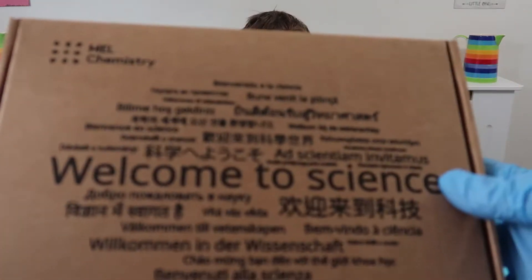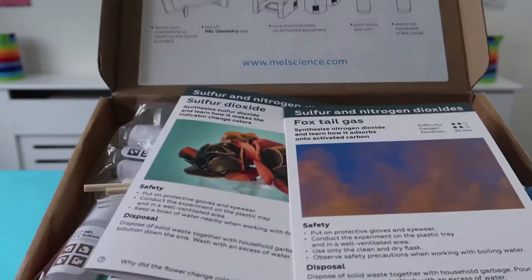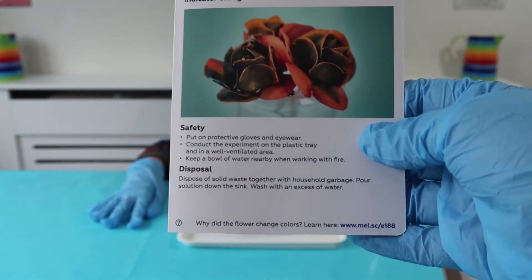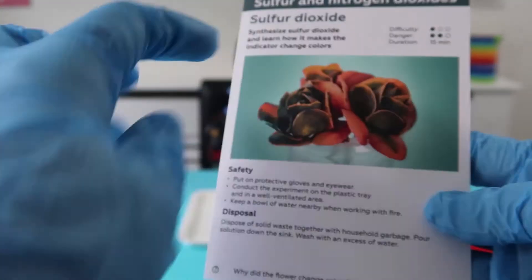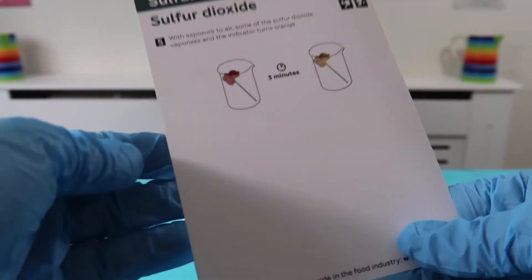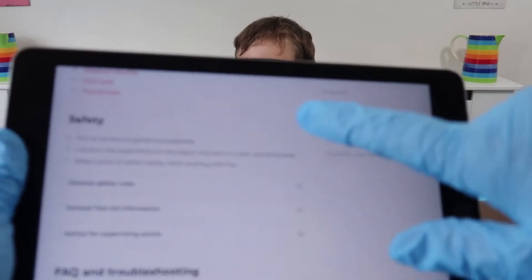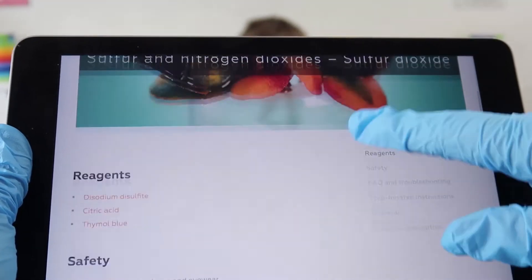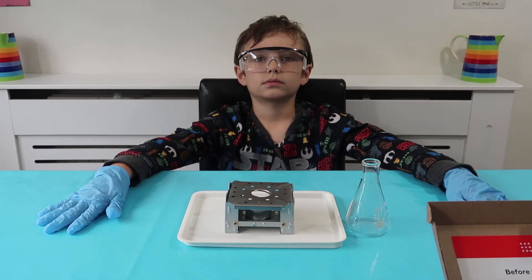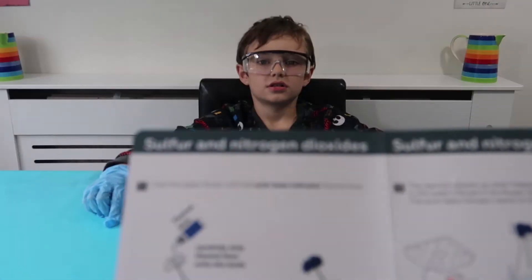These are lovely — I love the way that these are presented. Inside you always get a leaflet that gives you a quick rundown on everything you need to know: it's got the safety stuff, how to dispose of it after, and then instructions to perform the experiment. Inside we've also got the Mel Science app running at the moment which gives all of the details of the experiment too, so I think we are ready to proceed.